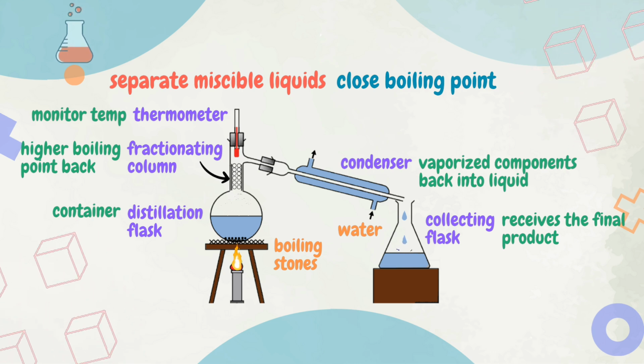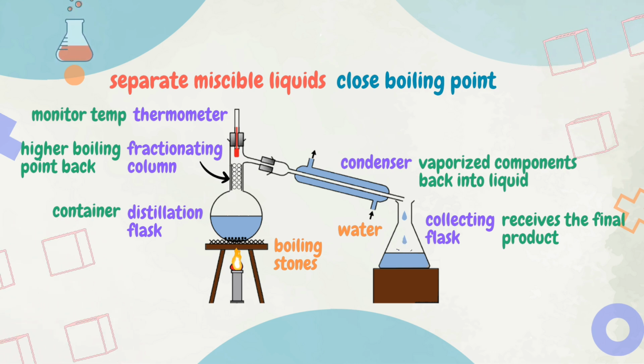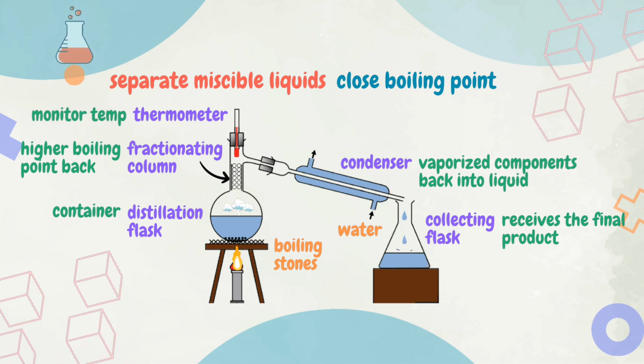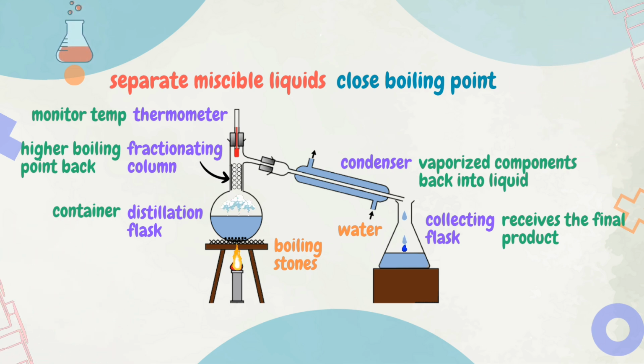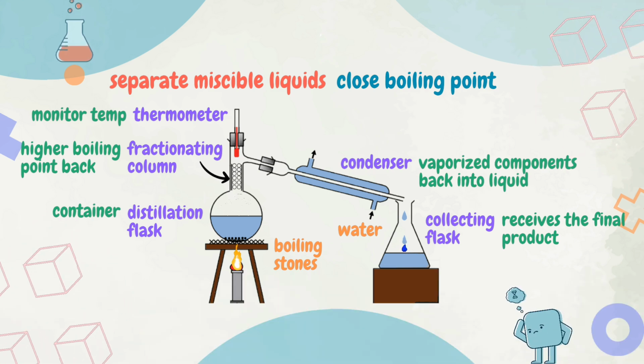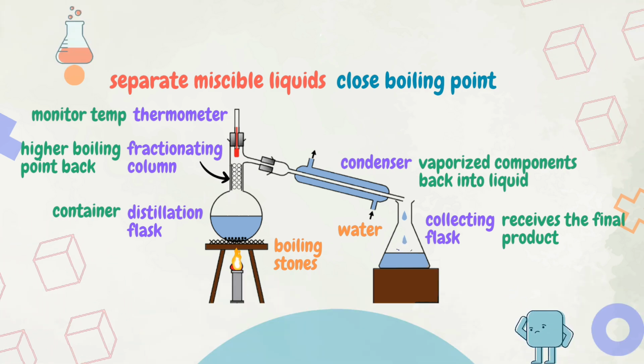bottom of the condenser. Beyond just separating liquids, fractional distillation plays a critical role in the production of essential oils, alcoholic beverages, and even in environmental processes like water purification. Did you know industrial fractionating columns can be as tall as a 30-story building?